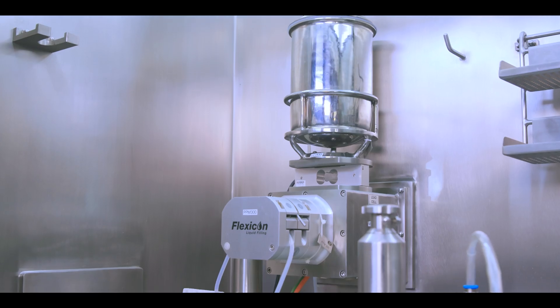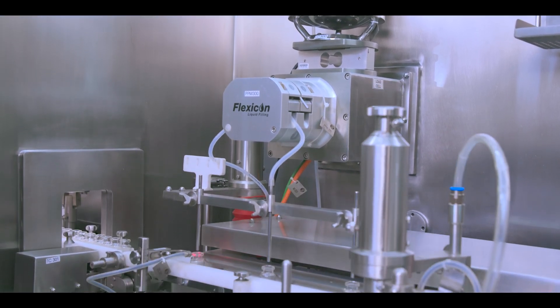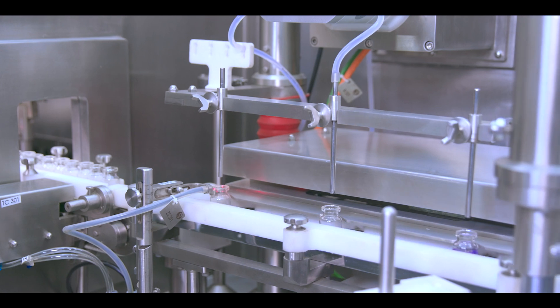The vial liquid filling and stoppering machine works under a positive pressure isolator. The filling is done by means of peristaltic pump.